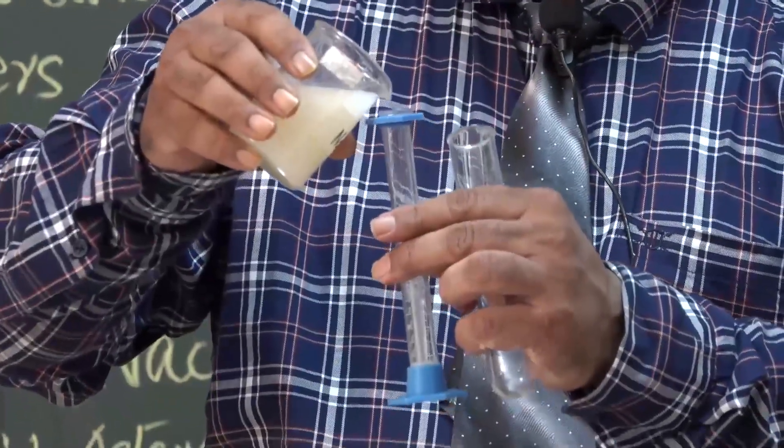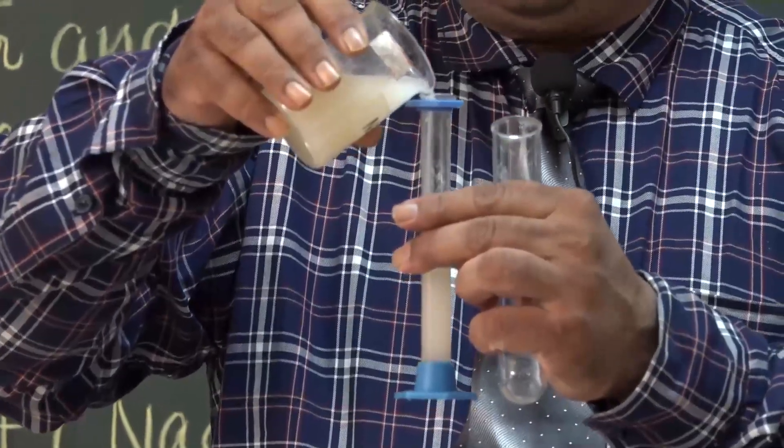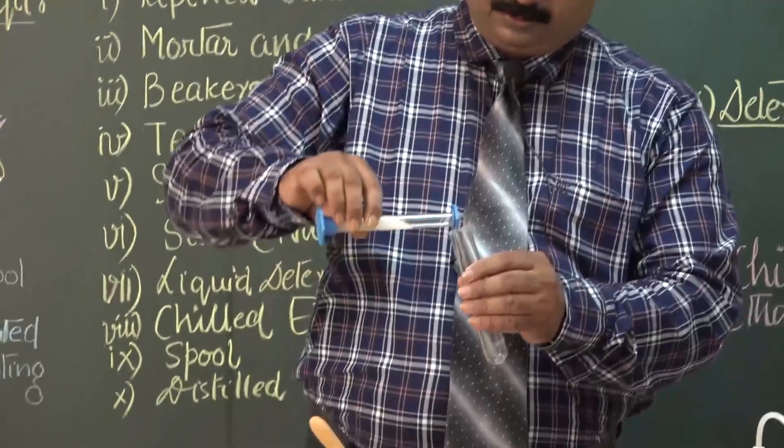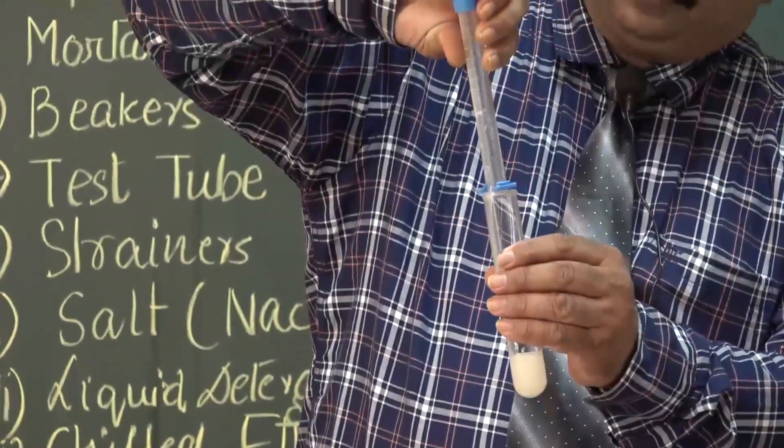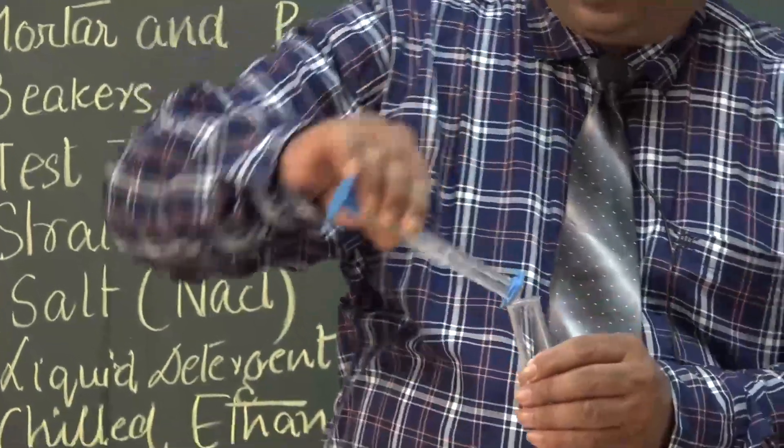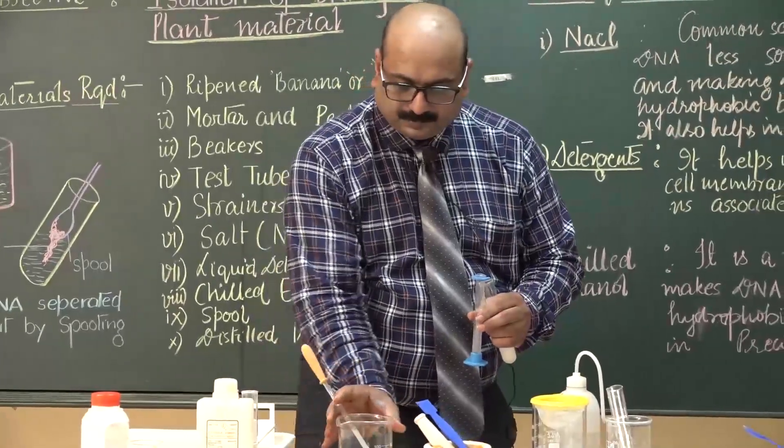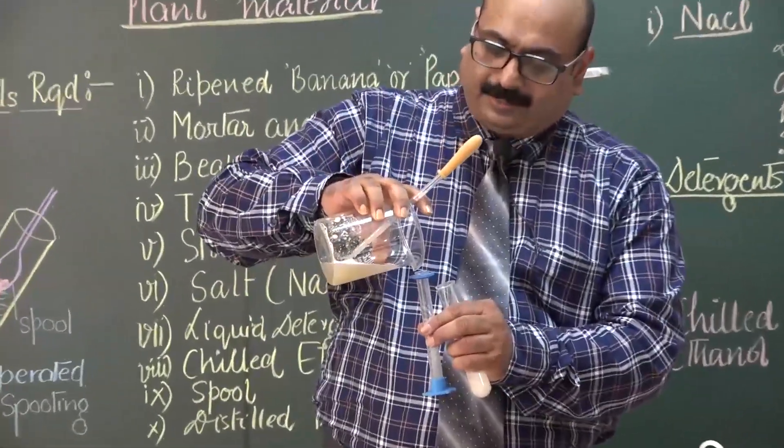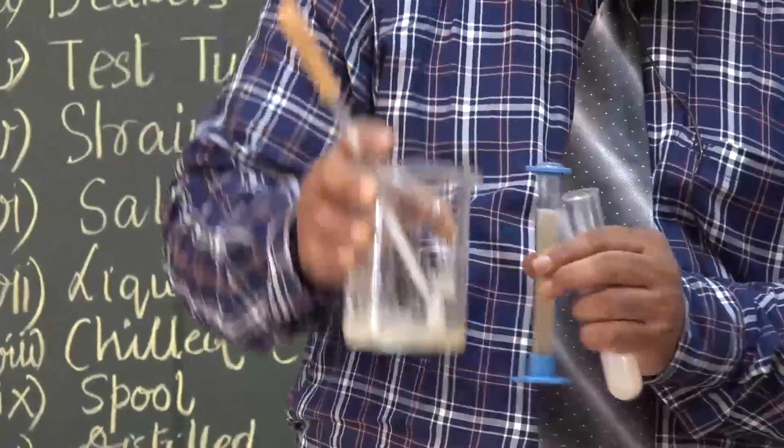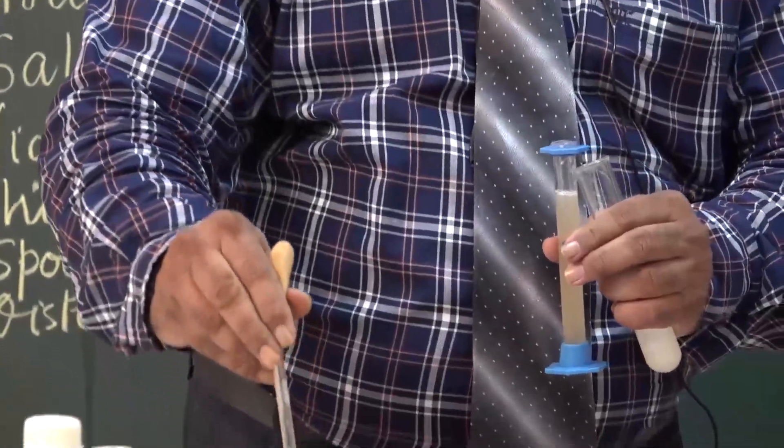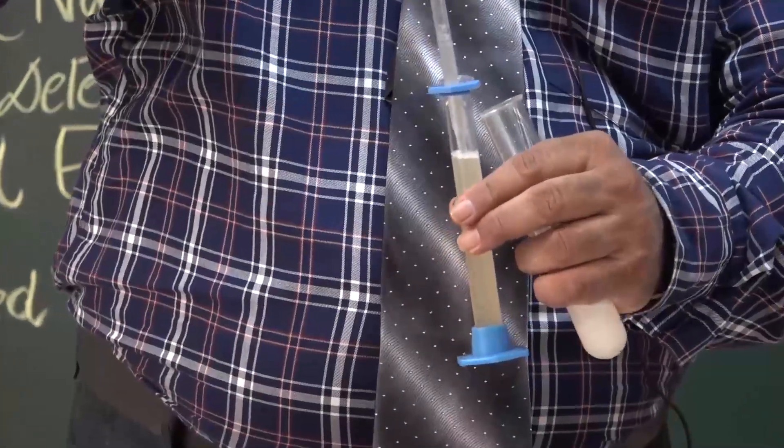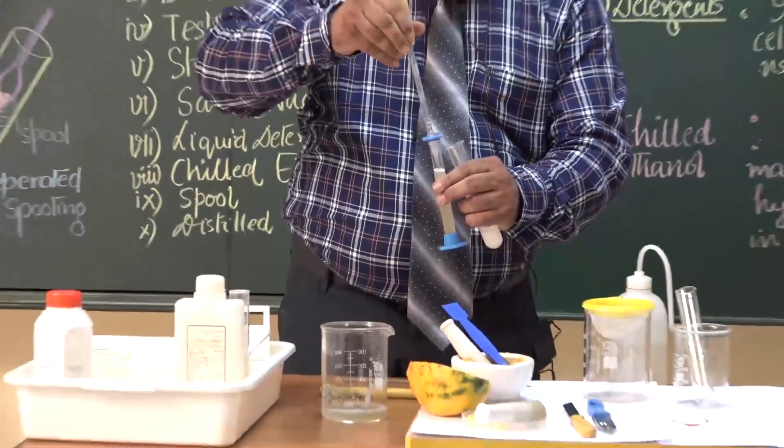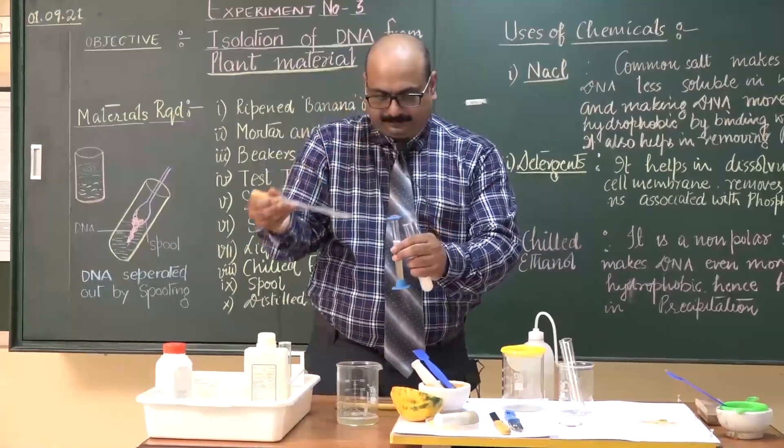You have to take precaution that it must be measured. This is 10 ml of NaCl and liquid detergent solution. Now, this 10 ml of banana cell suspension extract. Yes, it is exactly 10 ml.